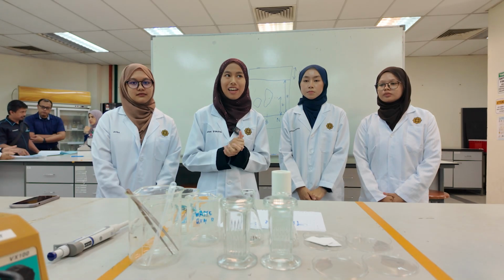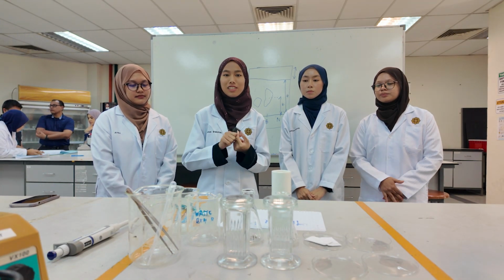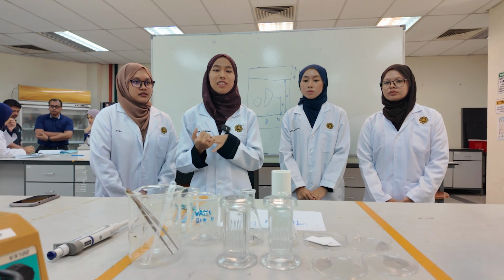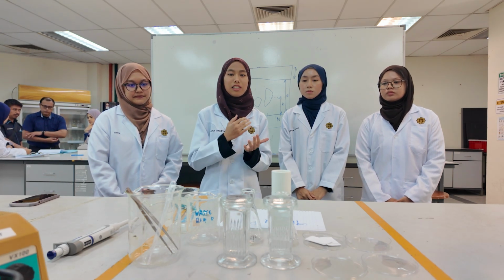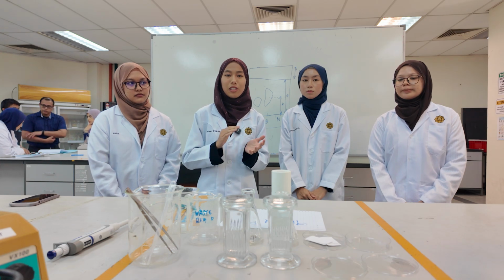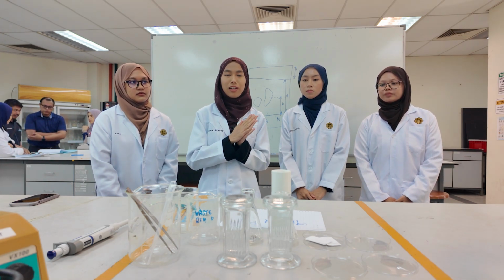TLC separates compounds based on their polarity and their interaction with the stationary phase. The principle is that the higher the polarity, the more it interacts with the stationary phase. Therefore, it slows down the movement of the compound up the plate.